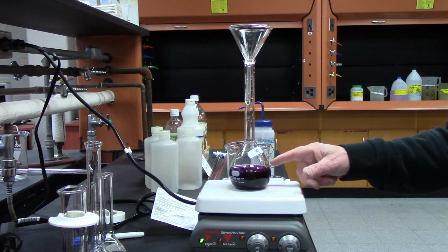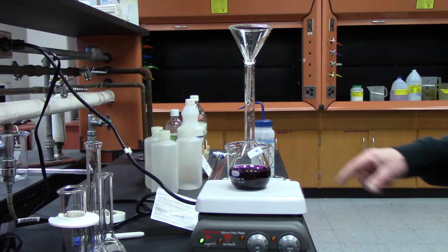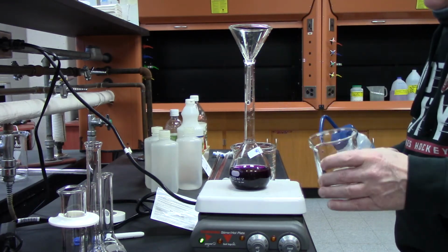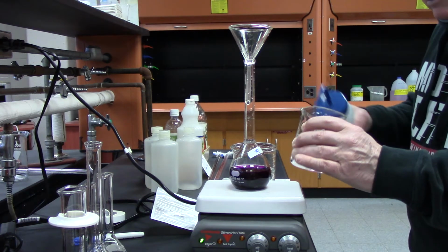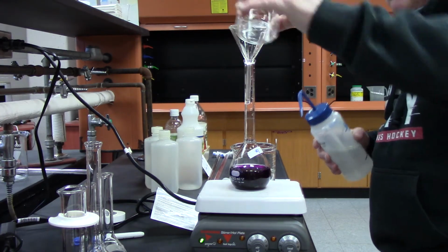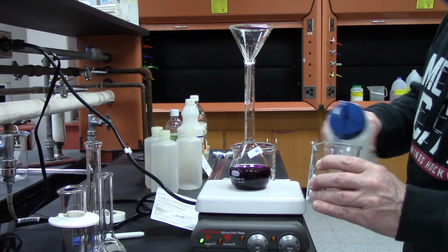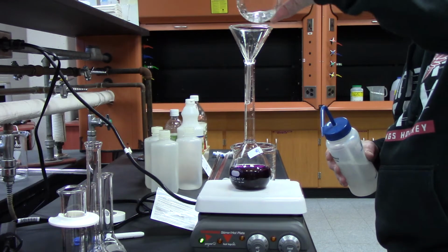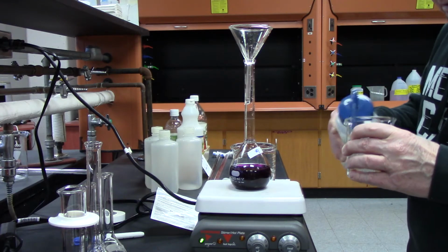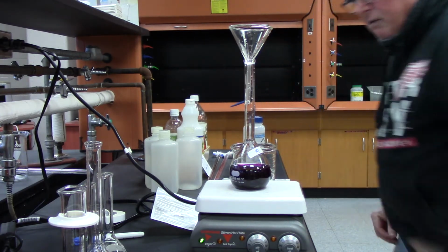Next step is to add distilled water so that it's to its mark. Now I'm going to add it with, oh, I forgot. I have to rinse out my beaker because there's leftover in here. So I use a water bottle and I just rinse it out. It's good to do it maybe 3 or 4 times. You want to get all of your solution. All right. Now I need to bring up the volume.